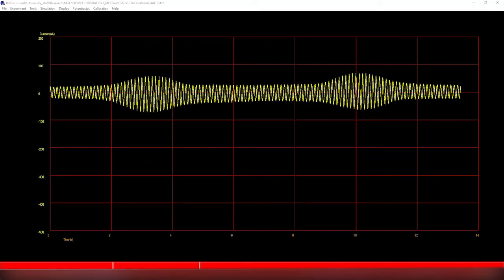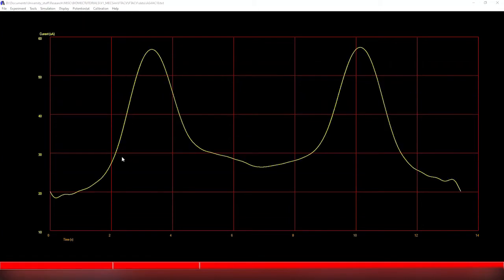So this is what one of the harmonics looks like. Here you have the first harmonic here, the background capacitance in this region here. Now when we are fitting it to the background capacitance, we end up just picking, say, a region here, a region here, a region here, a region here, here, and here, and then we fit to the background like so. This isn't the nicest of backgrounds, but it should be fair enough for what we're going to use it for.